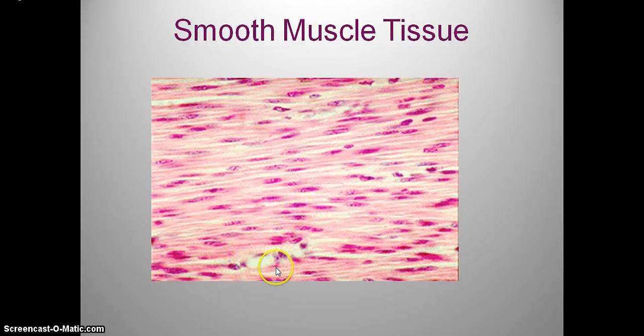Here, for example, is a cross-section of a vessel passing through the muscles. We know that blood must be flowing or make contact with the muscle cells, with the fiber cells, so oxygen can be transported, diffused. All right, let's look at the next one.